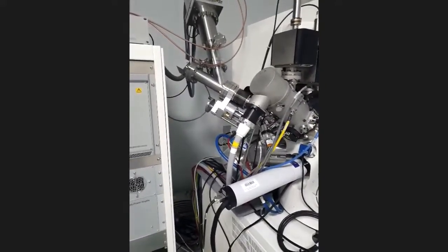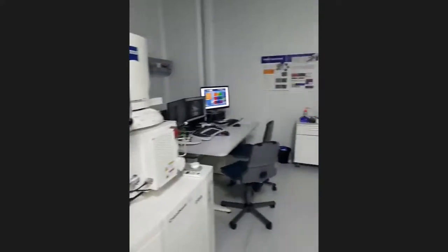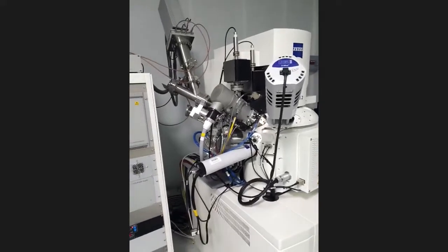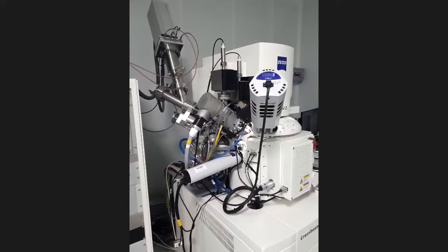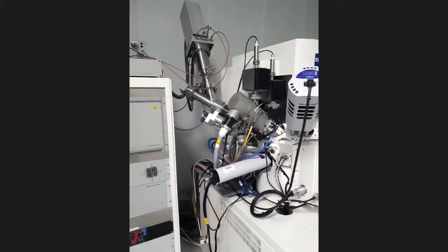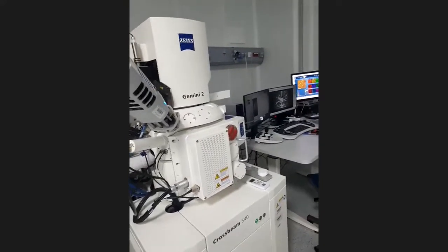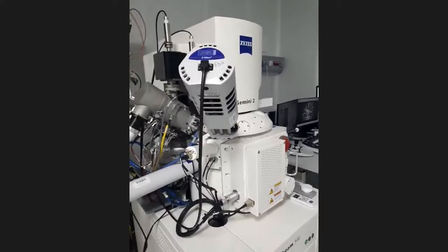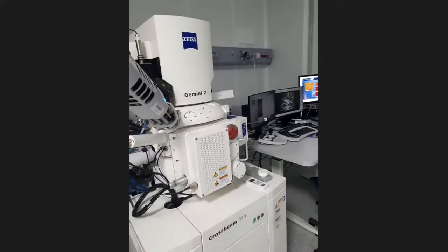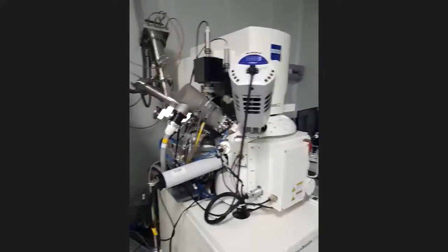Of course, you can take this data from XRF or XRD, but the main feature of the electron microscope is that this data has a big locality, and you can visually recognize what it is. Just for example, some rock or another morphological element on your sample, and you can recognize it. Who is who? It is really great.